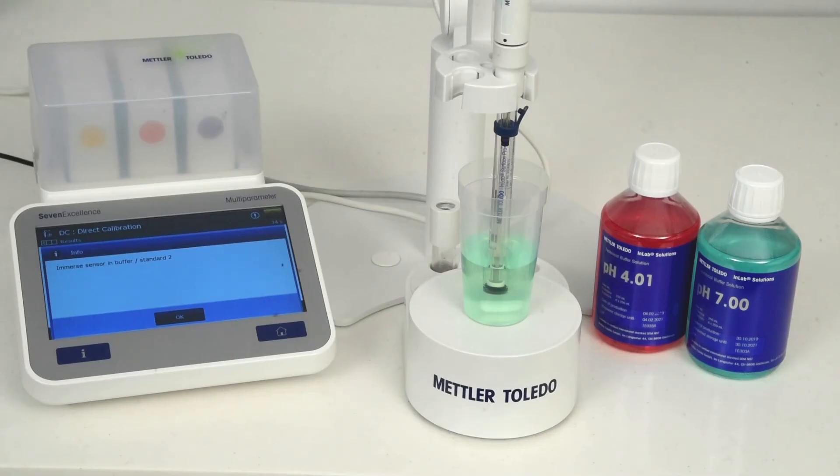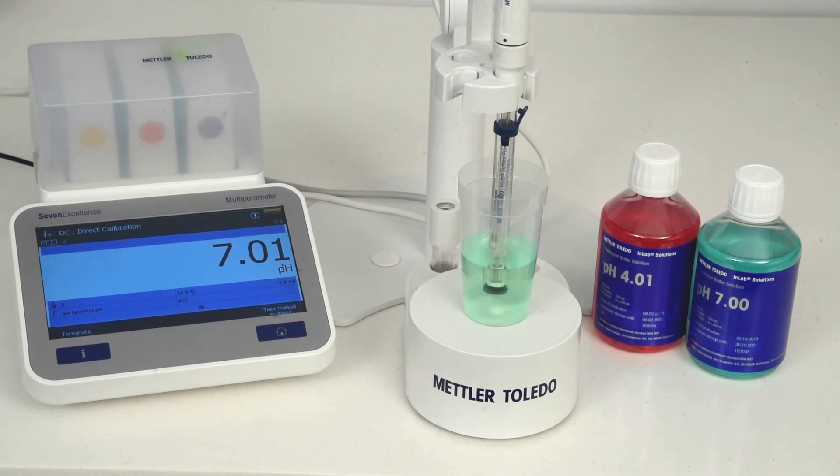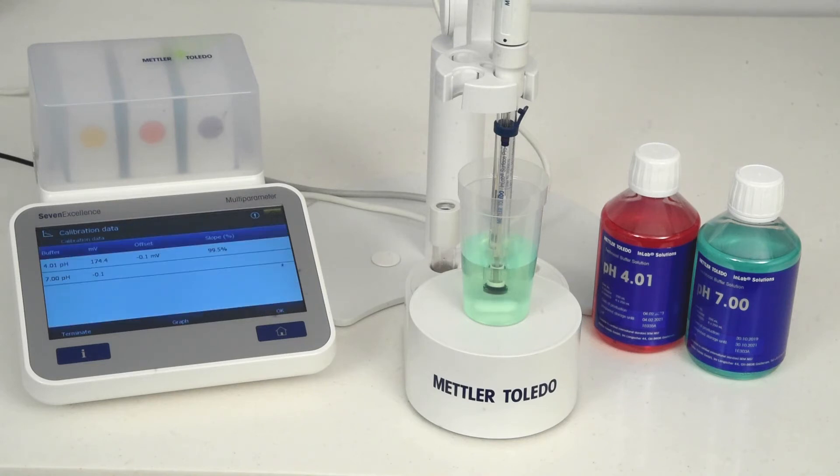Select the electrode and calibrate it with pH buffer solutions from Mettler Toledo. Use the buffers to bracket the sample pH range. Gentle stirring of the calibration solutions or samples with the YouMix magnetic stirrer ensures homogeneity and quick response.